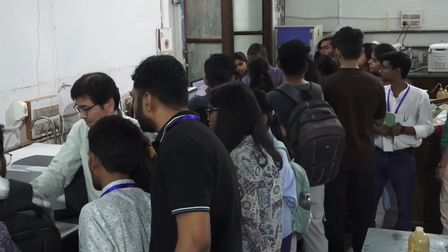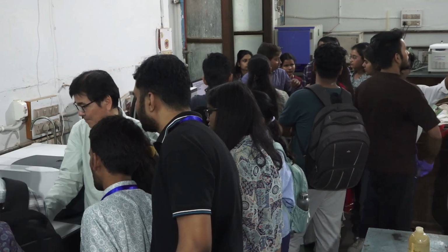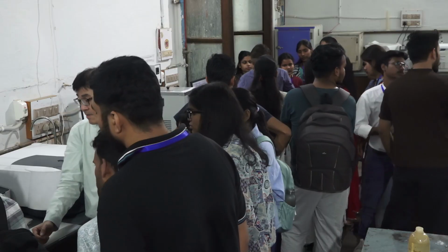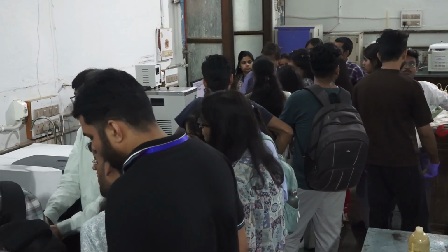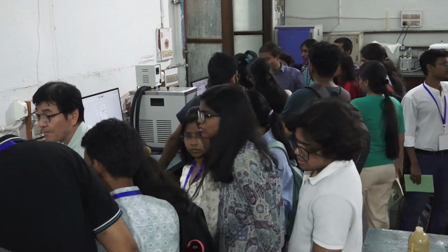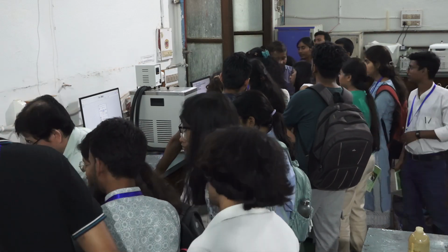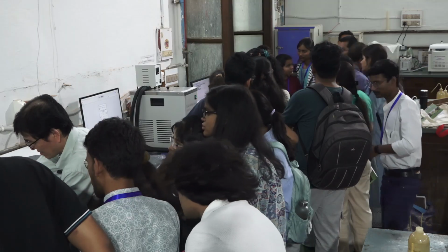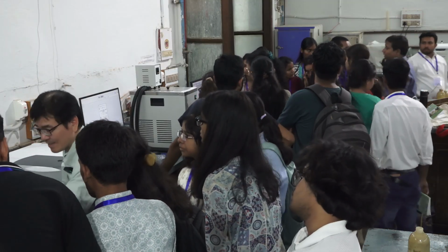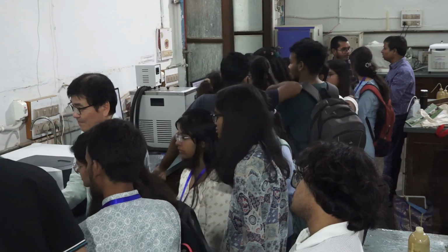Please push. Also, would you give me one paper? This part should also be clean, so do not wipe strongly. Only push. Only immerse. Fit.